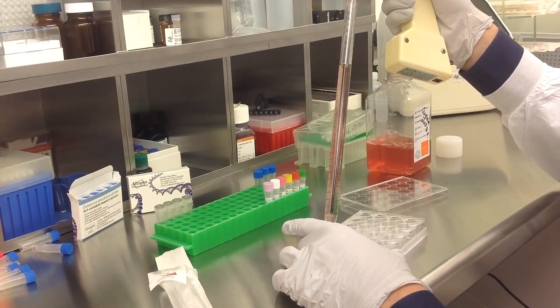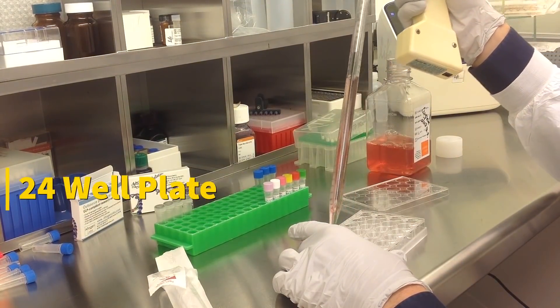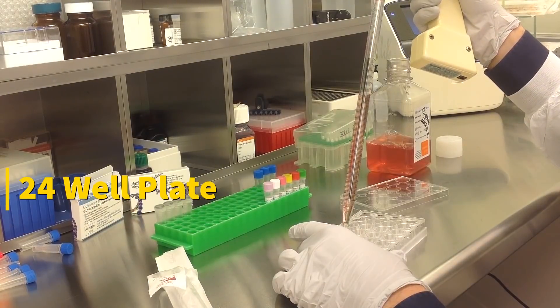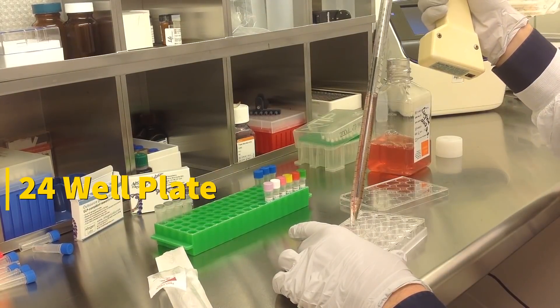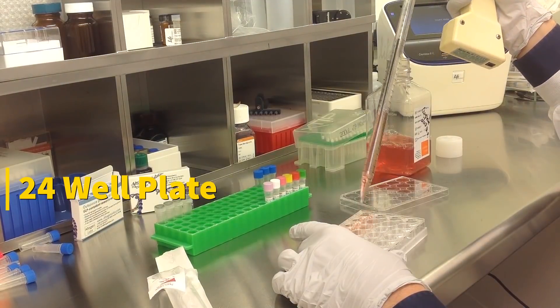Today we will be transfecting D451 cells obtained from ATCC, using a transfection kit manufactured by Altogen Biosystems. In this tutorial, we use a 24-well plate. Transfections can be scaled up or down based on plate surface area as described in the corresponding transfection protocol, which can be found at altogen.com.